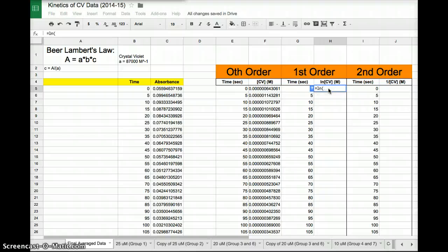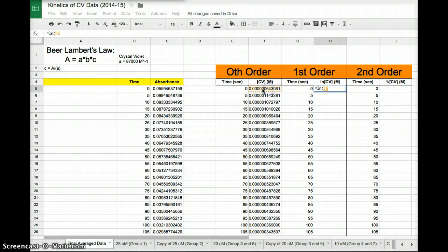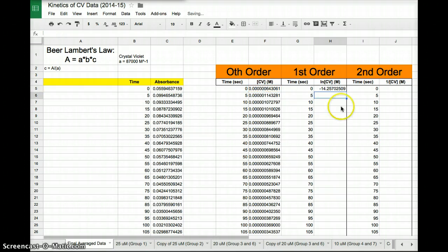Then I put open parentheses. What do I want to take the natural log of? I want the natural log of the concentration, which I just got. Boom. So natural log of that number. I hit enter. There it is.